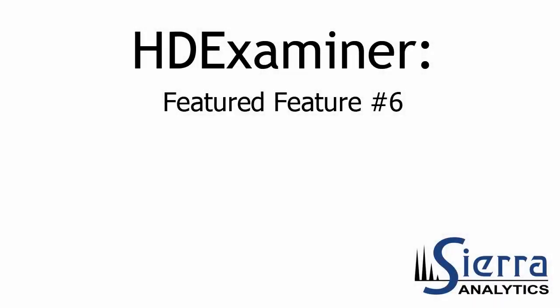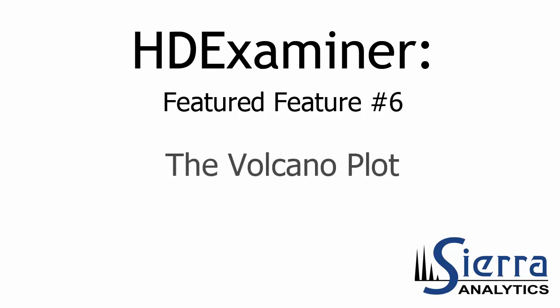Hi everyone, this is Jeff Morrow with Sierra Analytics and I'm here with another featured feature for HD Examiner. Today's featured feature is the Volcano Plot. What it does and why it's useful.